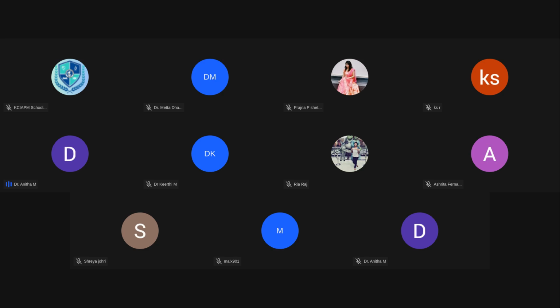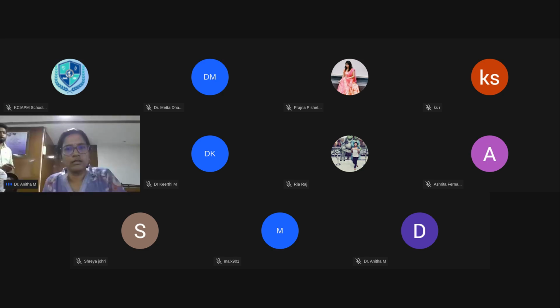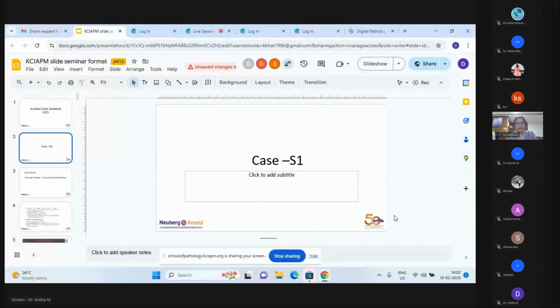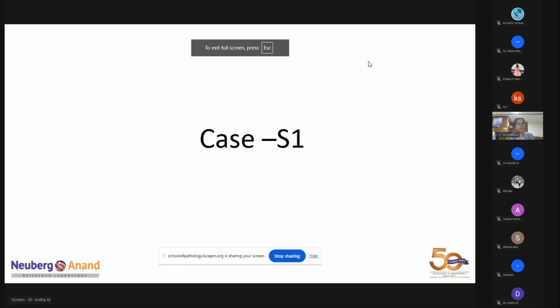That was a nice presentation. Thank you, ma'am. Can you tell me what is the adequacy? How do you assess the adequacy of a smear, Manju? 8,000 to 12,000, ma'am, on conventional Pap smear. On LBC? 5,000, ma'am.